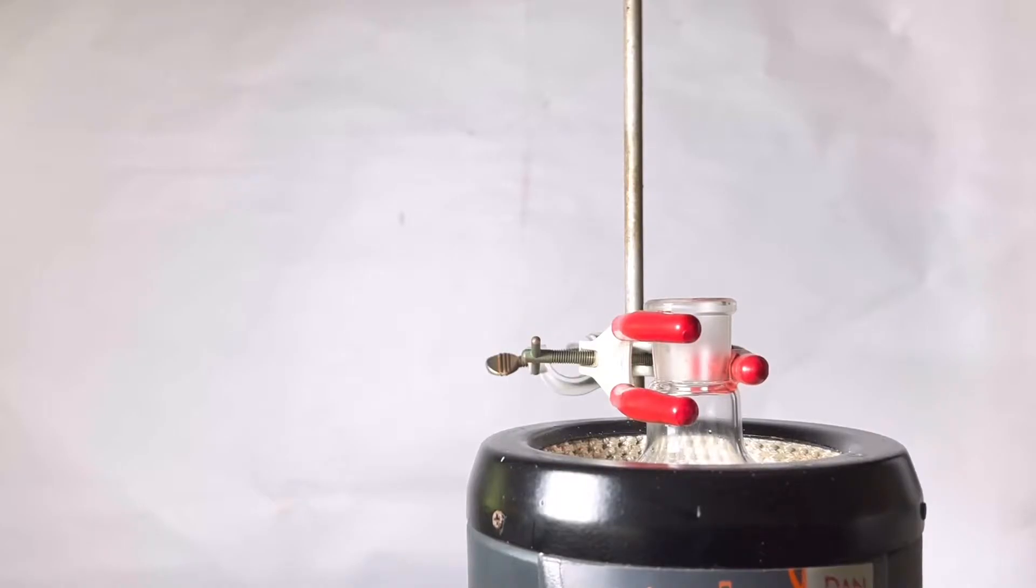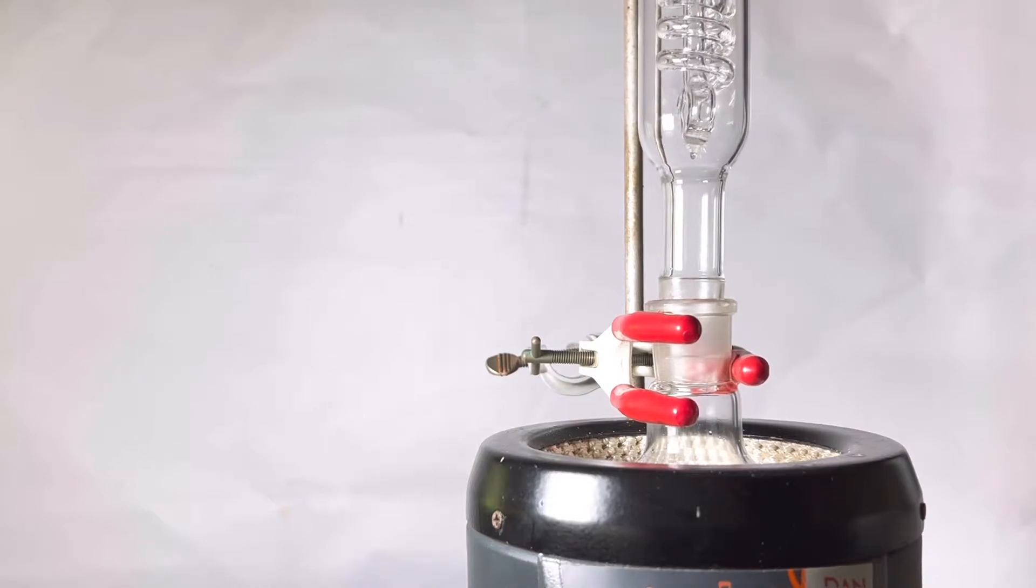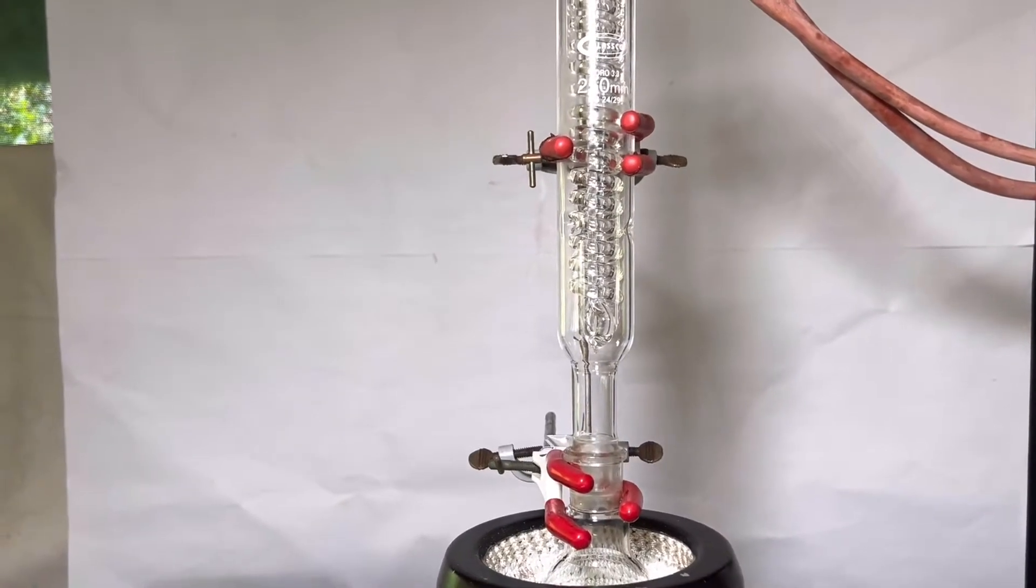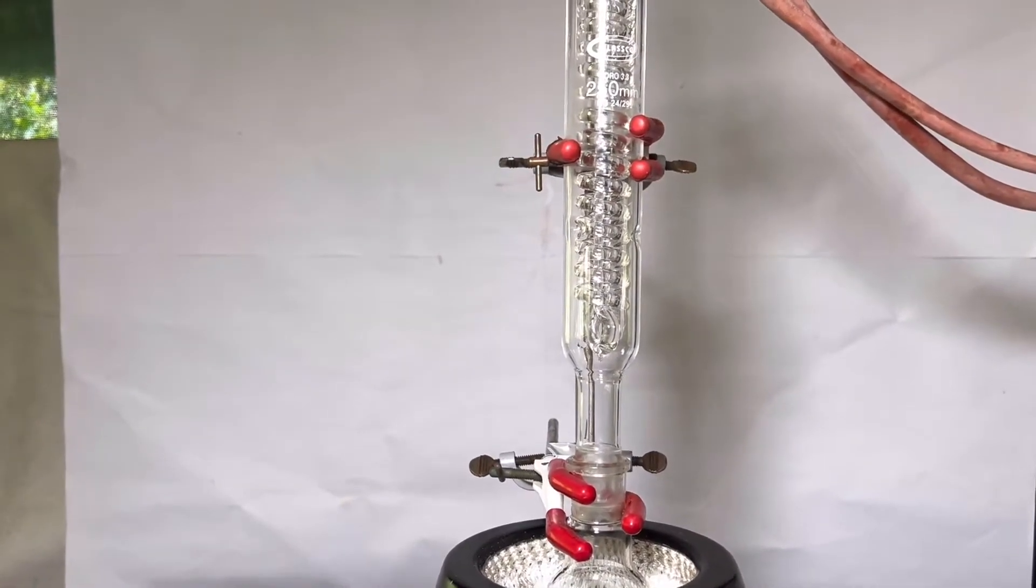The flask was placed in a heating mantle equipped with a dimroth condenser. Then the reaction mixture was refluxed for 1 hour 30 minutes. By this time the butyl cyanide which remained as a separate layer would disappear.